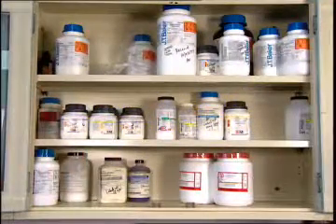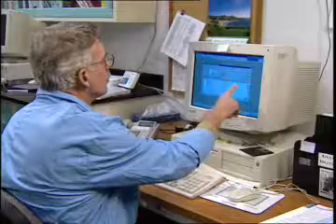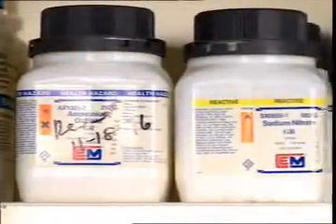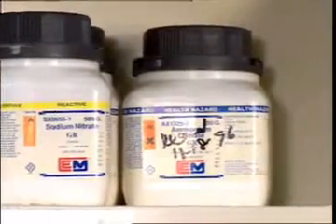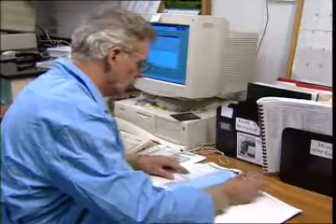Controlling inventory of reagents and chemicals can help reduce hazardous waste generated from old, deteriorated, or expired chemicals. Try to avoid over-ordering of reagents, supplies, and materials, especially those with short shelf lives. Supplies that have exceeded their shelf life will have to be discarded and may be hazardous wastes. By limiting order quantities to the amount you know will be used within a reasonable period, you avoid generating a hazardous waste through material expiration.